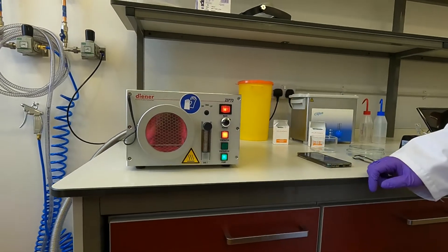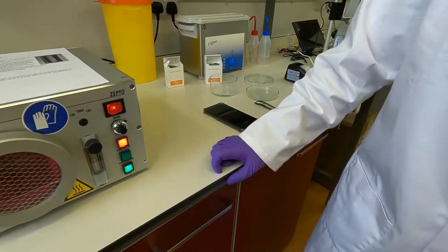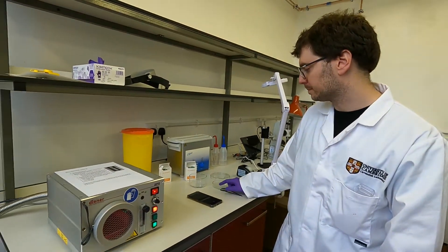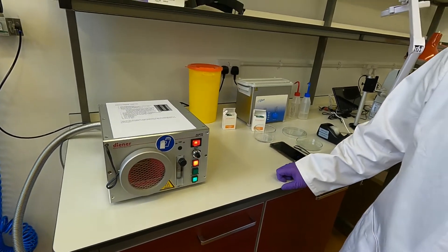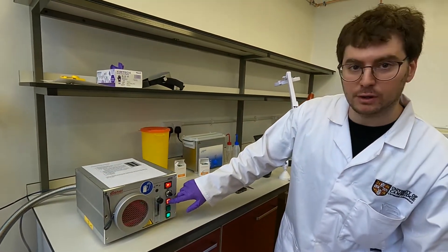There we go — this is the plasma that we're looking for. I'm starting the timer for 15 seconds for the process to complete. We're 10 seconds in... and 15 seconds. I can now turn off the generator.